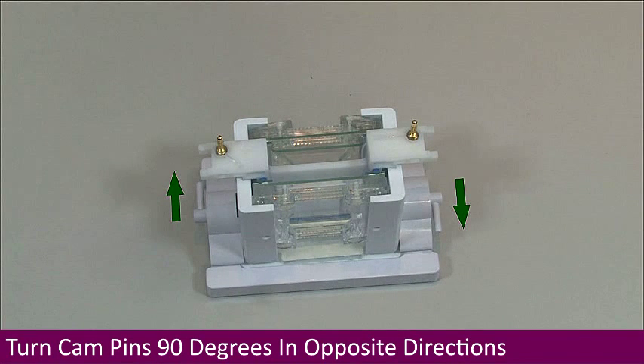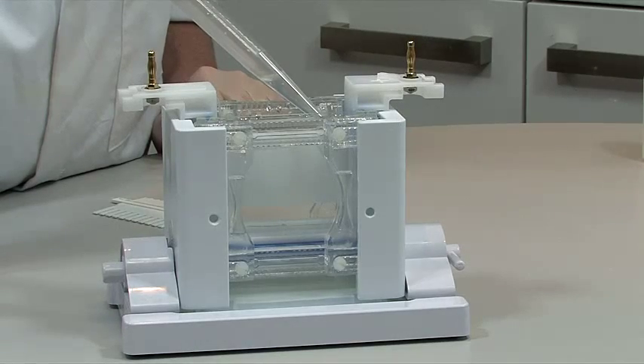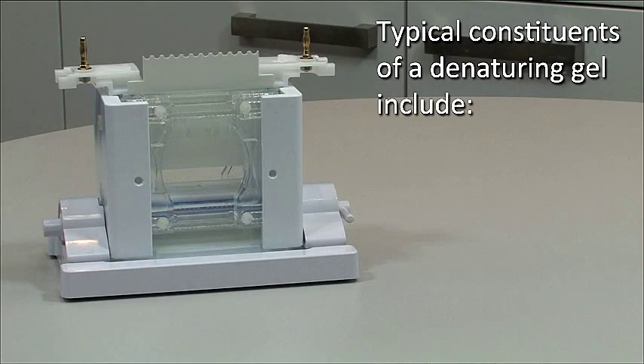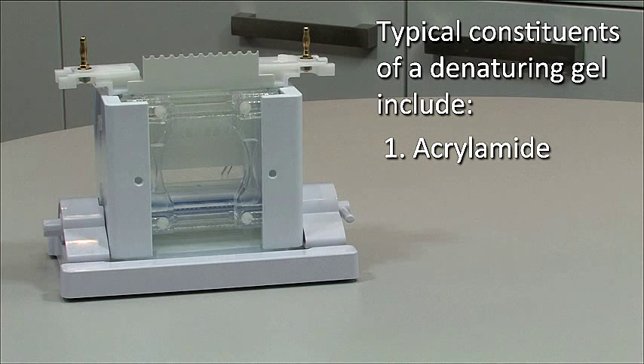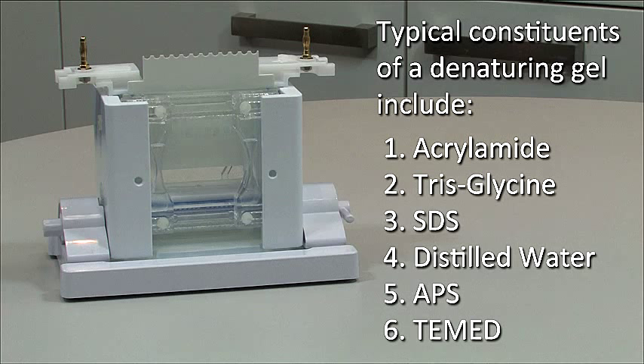After 90 degrees, the cams will feel tight. The gel solution is now poured between the glass plates and the combs inserted. Typical constituents of a denaturing gel include acrylamide, tris-glycine, SDS, distilled water, APS, and TEMED. The formulation may vary according to acrylamide percentage and the size range of the proteins being resolved, but the constituents remain the same.